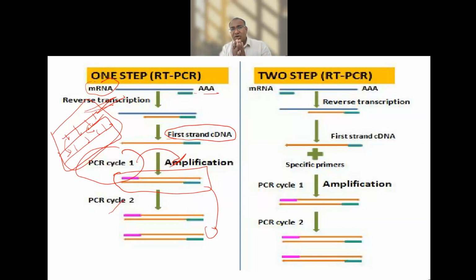A very important point we have learned today. So I use one step also, I use two steps also. You got the point here. Now here it's very important for me to understand two steps as well as one step. So what I am going to do here, I am using the specific primers here. Did you see an addition here? Two steps. Got it here.